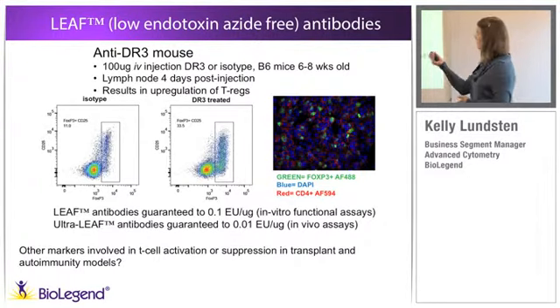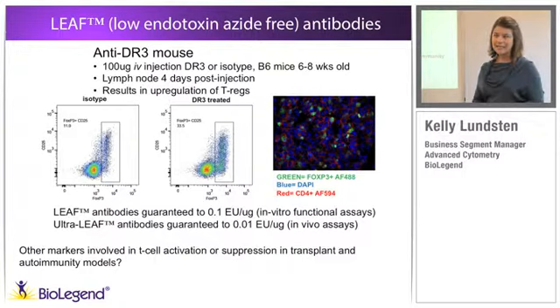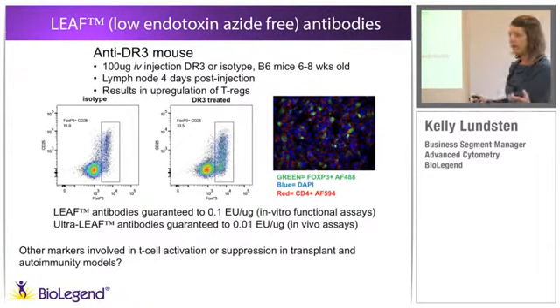And in general, I'm going to use this term a lot. It's called LEAF. It's a low endotoxin azide-free format of an antibody that just ensures that when you are doing a direct injection of an antibody, you're not encountering some aberrations that come with contamination of that antibody.